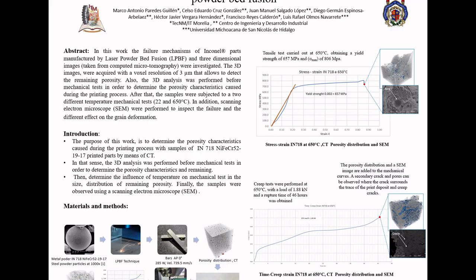The porosity distribution and SEM images are added to the mechanical curves. Secondary cracks and pores can be observed, where the crack surrounds the trace of the print deposit, and also creep cracks.